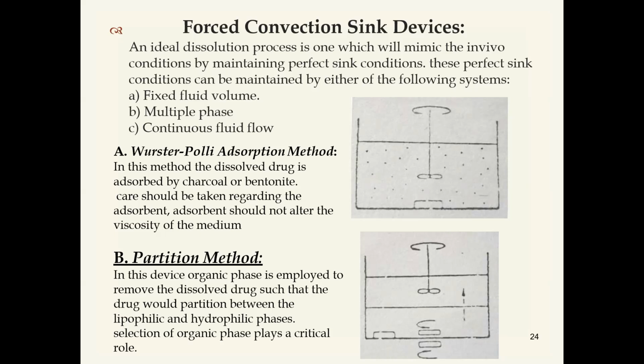Why? Because the drug concentration in the dissolution medium should not exceed 10 to 20% of its solubility. If the drug concentration is very high, that's the reason we need to change the dissolution medium to maintain sink conditions. So the dissolution process should mimic the in vivo conditions by maintaining perfect sink conditions. These perfect sink conditions can be maintained by these systems: fixed fluid volume, multiple phase, continuous fluid flow.